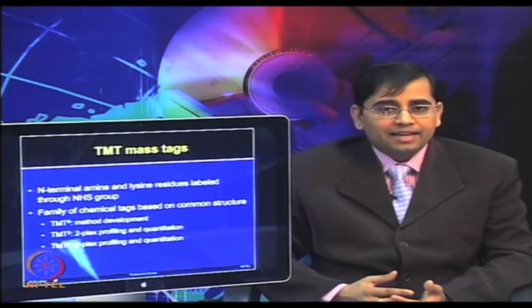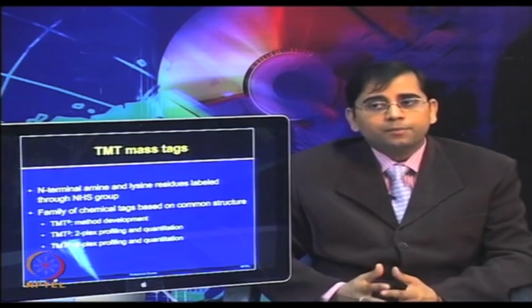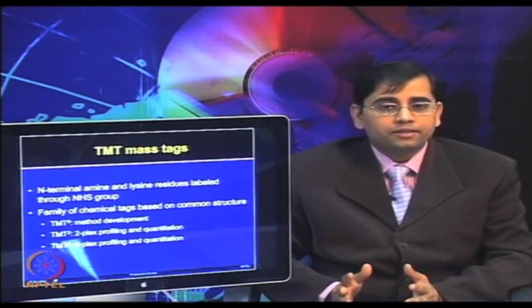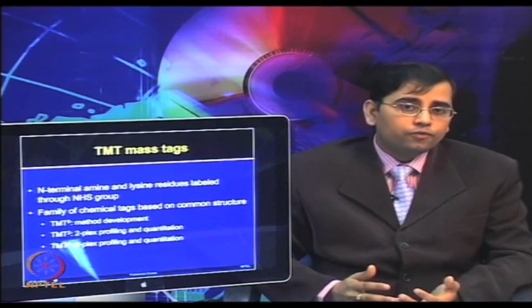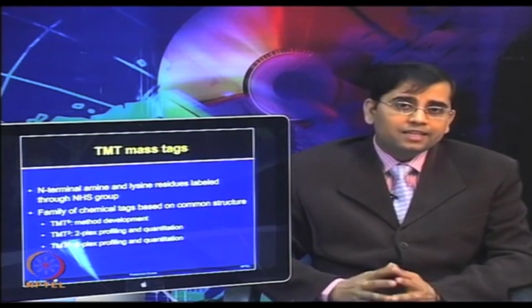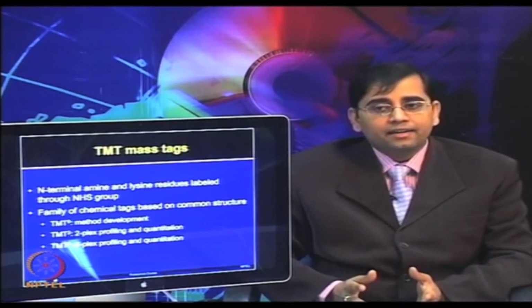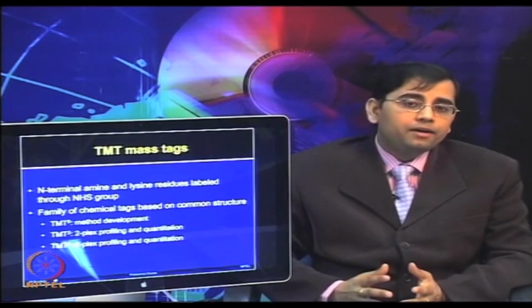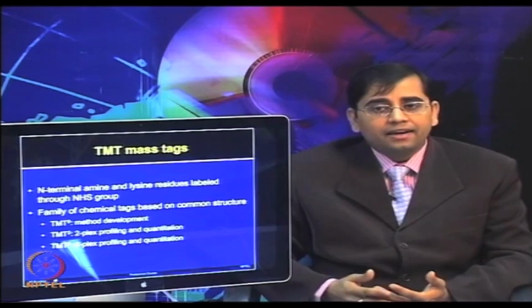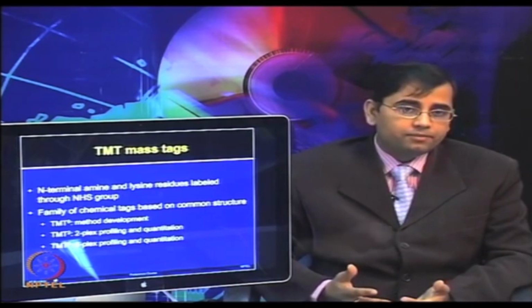During the MS/MS analysis, the TMT tags give rise to 6 reporter ions from 126 to 131 Daltons. Therefore, it allows for relative quantitation. For the TMT 6-plex, each tag adds a mass of 229 Daltons per labeled amine to the protein. The TMT duplex and TMT 0 share the same TMT core structure.